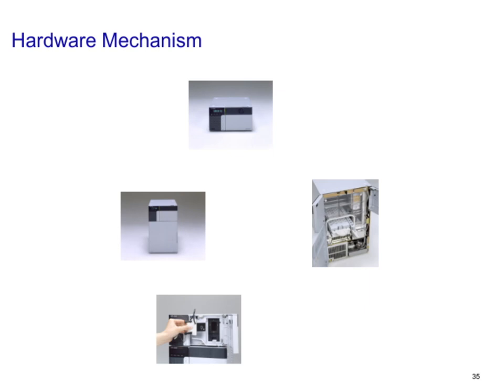All these components, pump type, injector connection, and cell structure, are interconnected. They form the core hardware mechanisms that enable our detectors to perform reliably and accurately. Understanding these elements helps us troubleshoot, improve, and innovate in our detection systems, ensuring high-quality results across various applications.